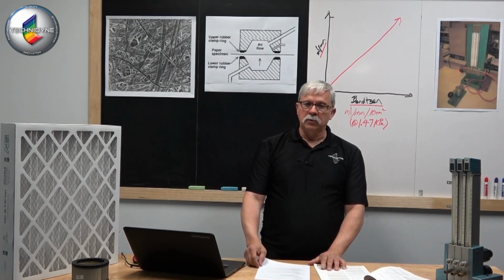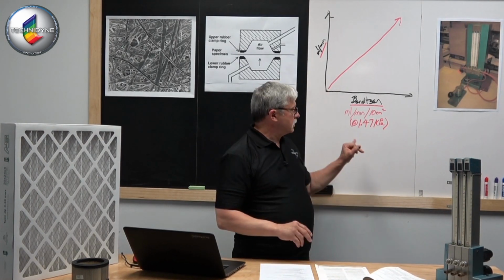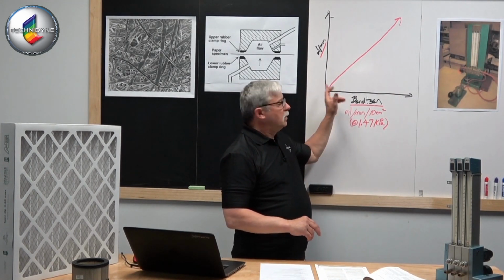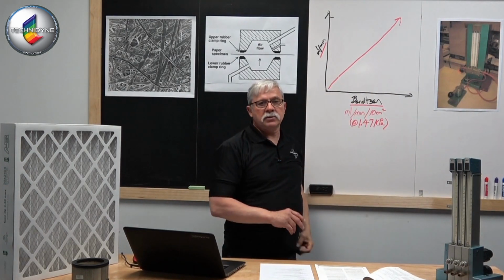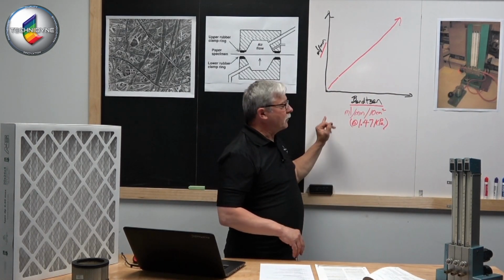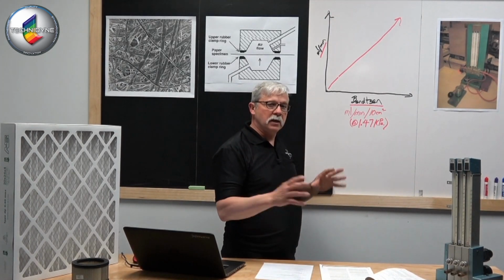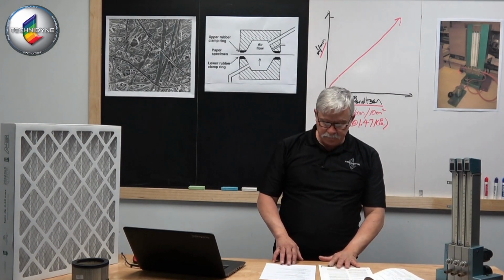And now for more open grades, if I were to utilize the standard or more common configuration, I might be way off the scale. Again, my accuracy would start to get lost. But if I can reduce that pressure differential, I can reduce the actual airflow going across that sample and get a pretty decent measurement.